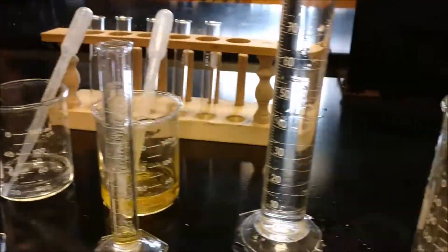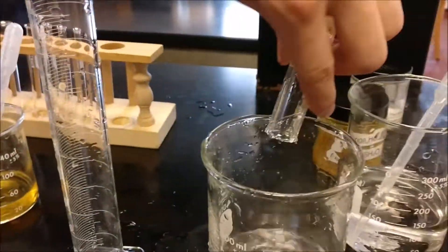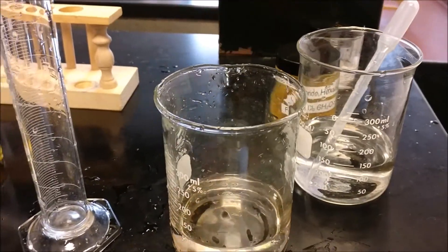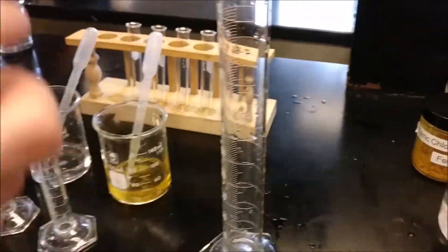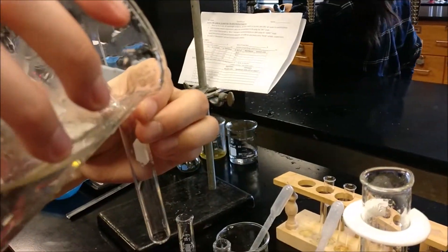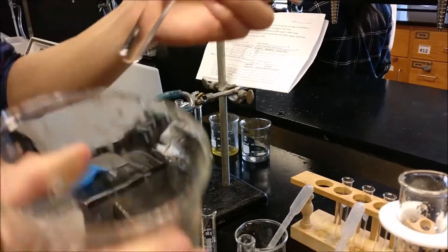Measure out 98 ml of water in the 100 ml graduated cylinder and pour it into the large beaker. Add the sodium thiocyanate solution and iron-3-chloride solution into the water. Swirl the solution and pour it into the first test tube so it's about three quarters full. Dispose of the rest in the sink.